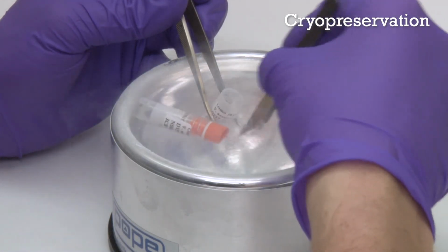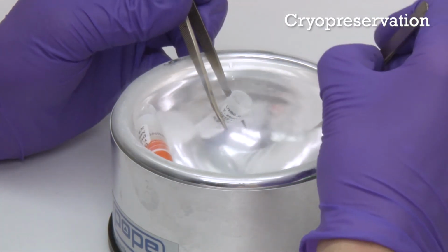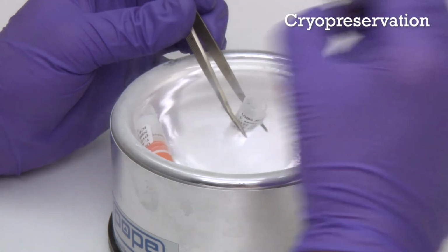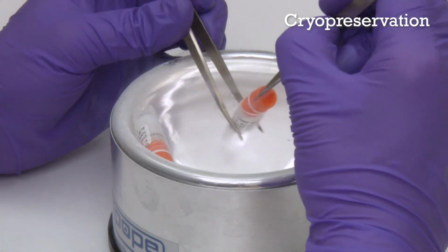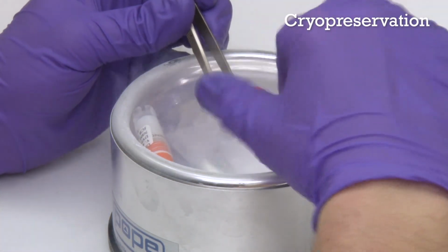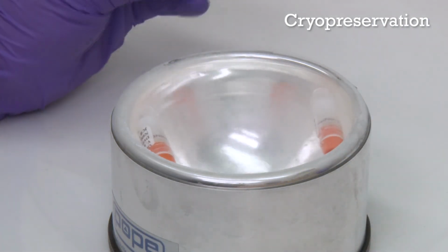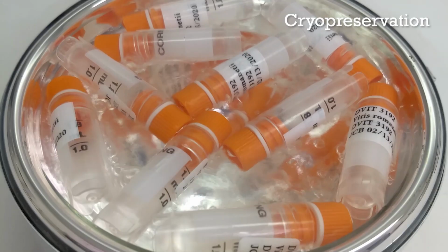So once the vials are in a container of liquid nitrogen, the cap is removed. Any liquid nitrogen that's in the vial is removed, and then the lid is placed back onto the vial and tightened. There's another picture of the foil strip being put inside of the vials, and here we have the vials filled with foil strips.